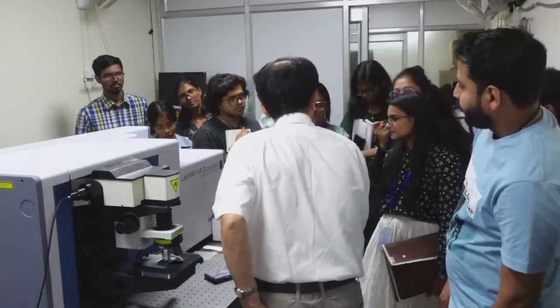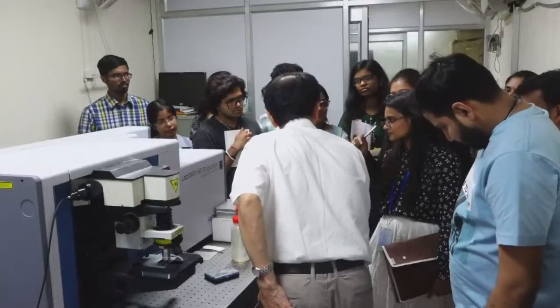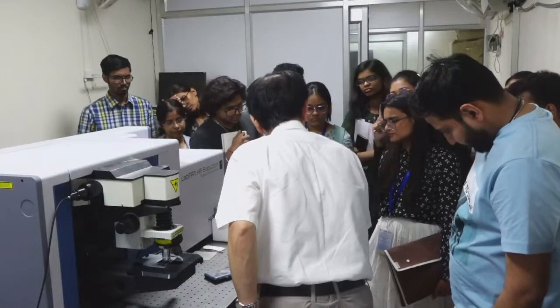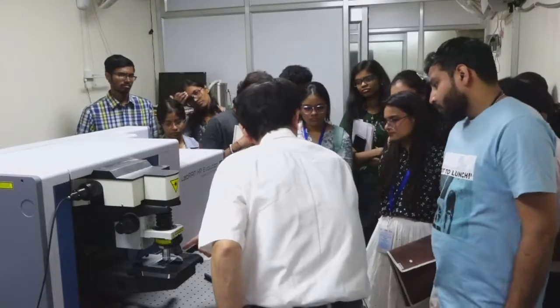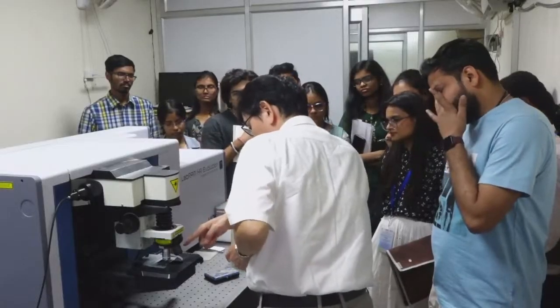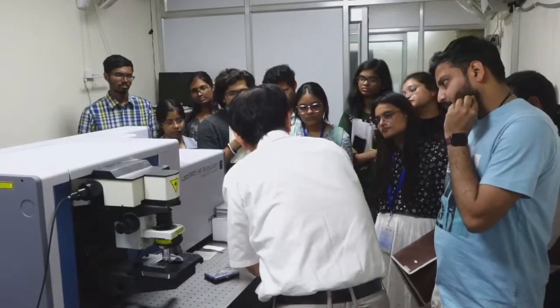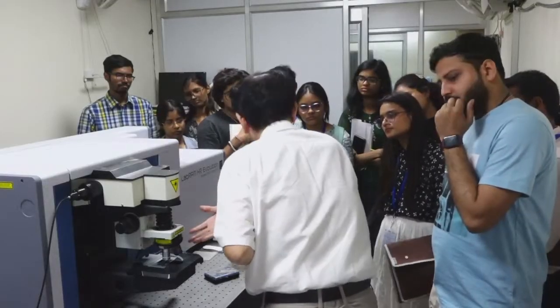So what is the need of signal collection? And in one only, like upright position, the light is coming from the upright or the downside. You explained the signal collection in one of them only. Signal collection is done by these optics. So this microscope objective focuses the light onto samples, so a very small spot is illuminated. And the scattered light is also collected by this.